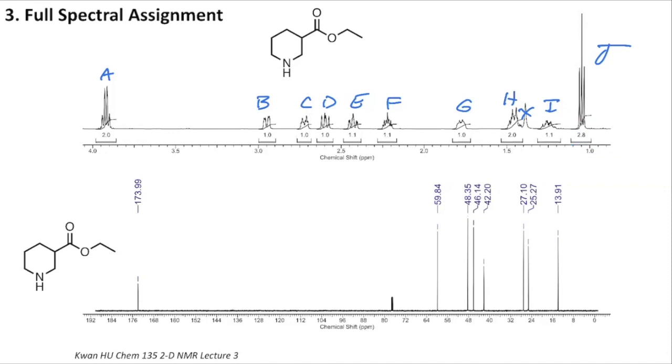When we first learn about peak splitting, we give you some really clean, clear-cut examples to give you an idea of where this splitting comes from and how it works. But in real life, when you're looking at real molecules, just like this one that's pictured at the top center of our screen, the splitting doesn't always work out as neat as we might hope. So because of that, we're going to see some, maybe not so nice looking splitting of these peaks today.